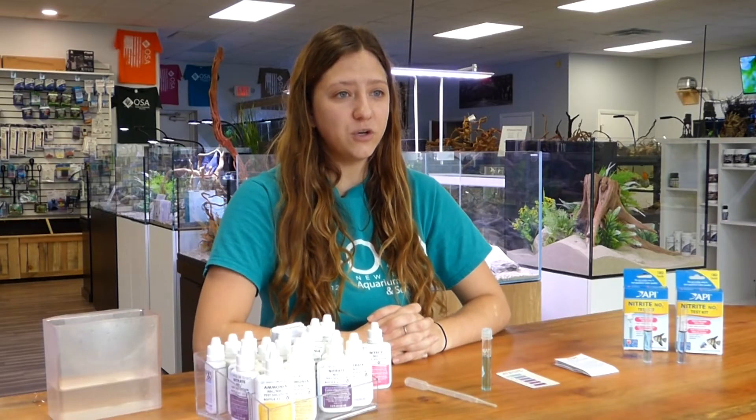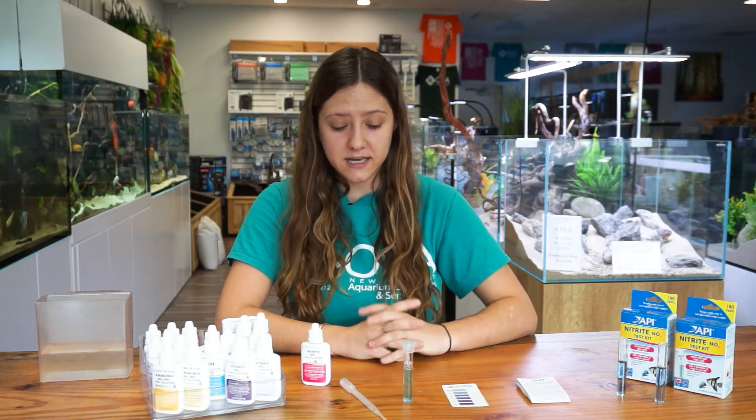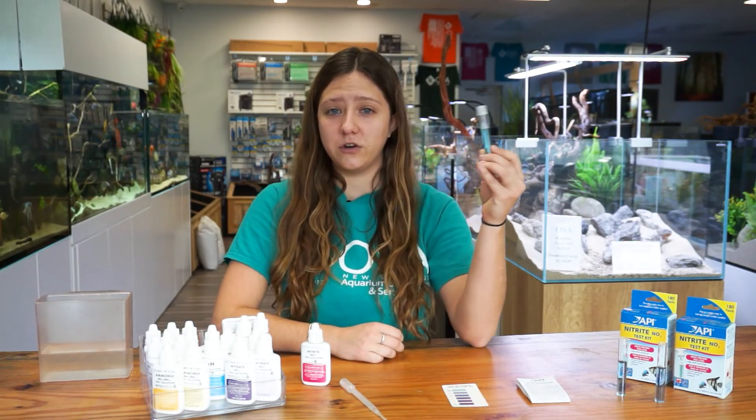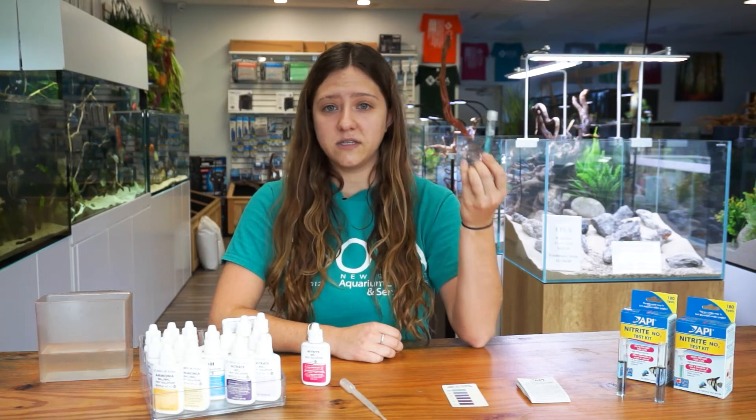Another thing to note: after you are finished conducting your API nitrite test kit, you want to make sure that you do not pour this water back into your aquarium. You want to make sure you dispose of it properly, either down the sink or down the toilet.